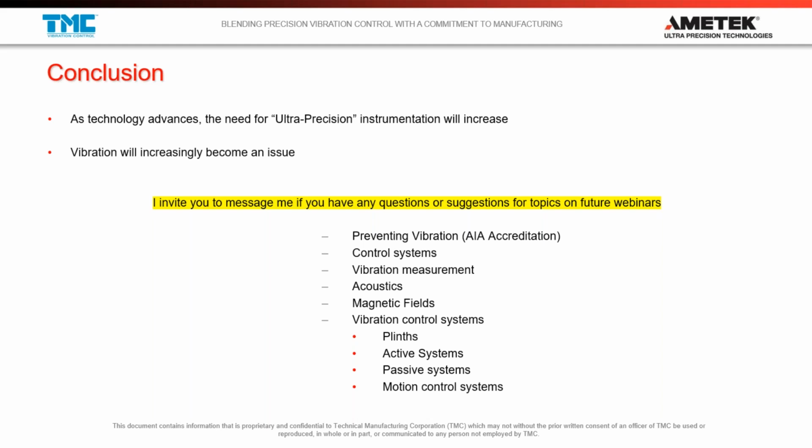Next one, I do atomic force microscopy. When I do control measurements of vibration systems into my system, I notice that there are vibrations at higher frequencies, higher than 200 hertz, somewhere around 500 to 1,000 hertz. What can be possible sources of vibration above 200 hertz? Can there be mechanical vibrations above 200 hertz?